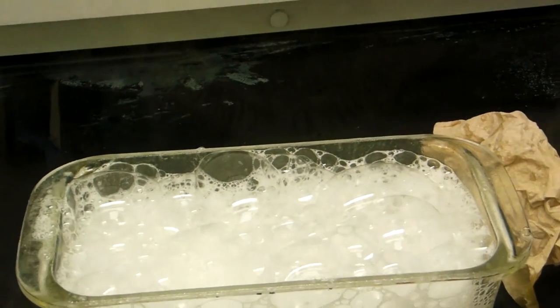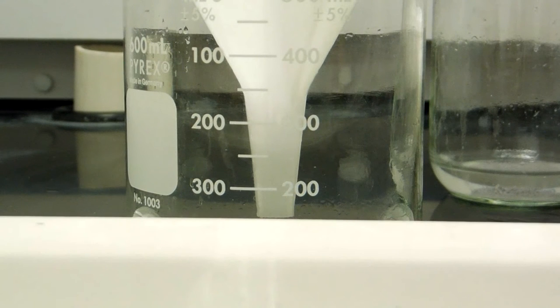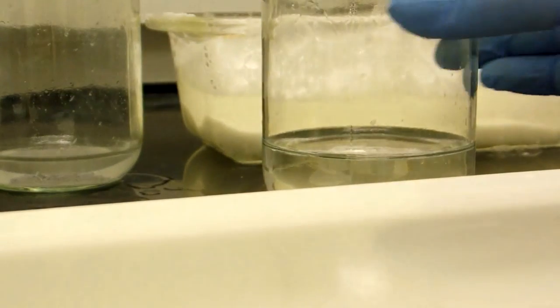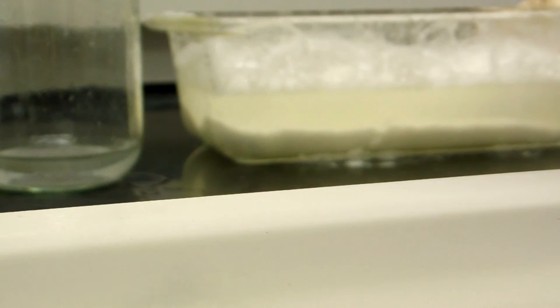As I begin to reach the bottom of the container that I'm filtering from, I'm trying to get a good position. I swirl it around the silver chloride so that I can pour out the entire contents of the jars, solid and all, into the funnel. So yeah, I keep swirling it around and it's spinning around like crazy.